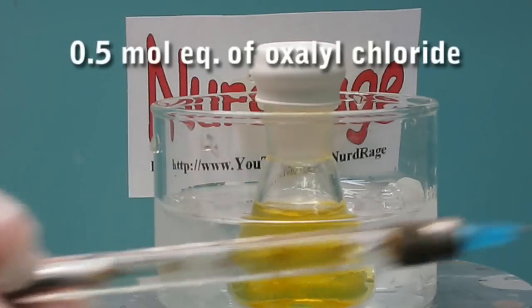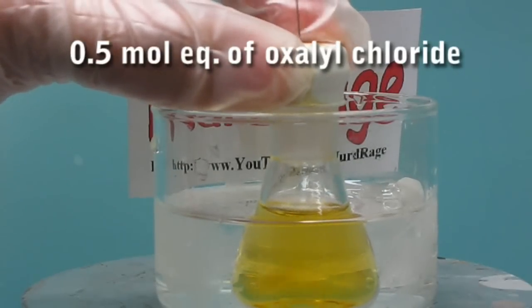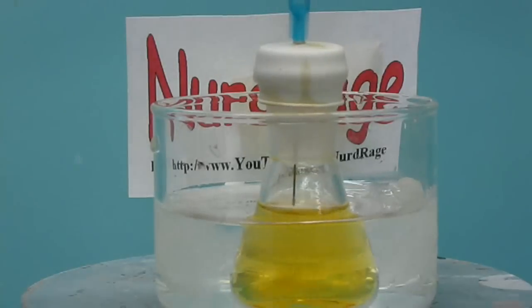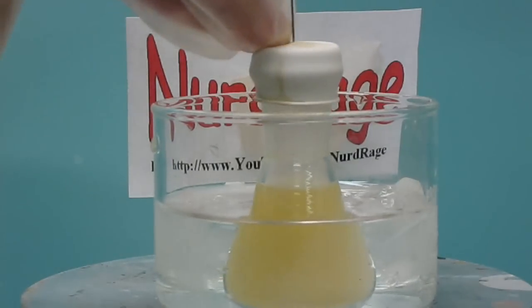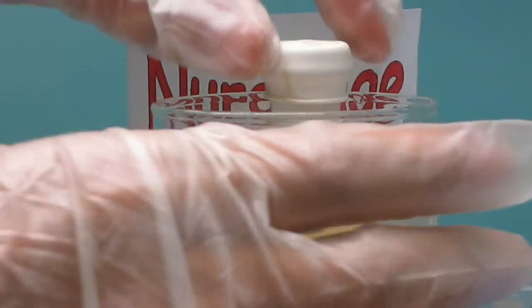Now inject 0.5 mole equivalent of oxalyl chloride. I'm using a 2 molar solution because that's what I have on hand, but you may use pure oxalyl chloride or any other dilution as long as you have the right stoichiometry. This addition should be performed slowly as it produces considerable heat. I time-lapsed this video but I actually spent 5 minutes injecting it. If you're doing this on a large scale, add the oxalyl chloride dropwise and take however long is needed to keep the temperature down. Once everything is injected and still cold, take it out of the ice bath.